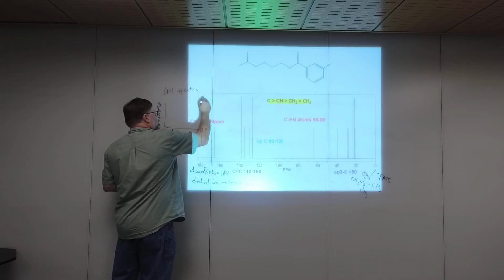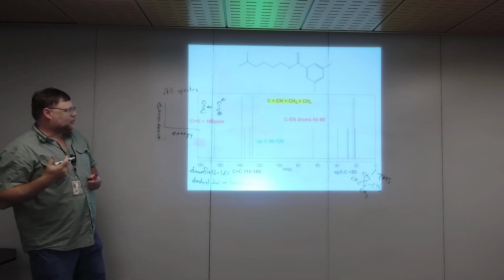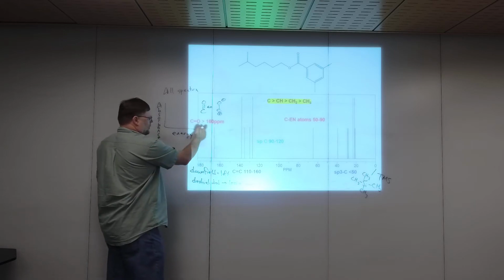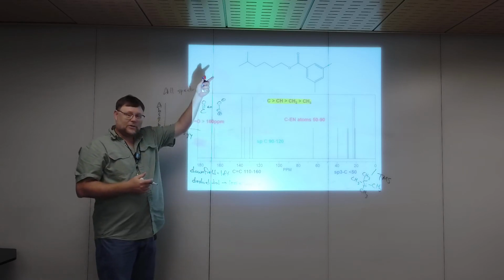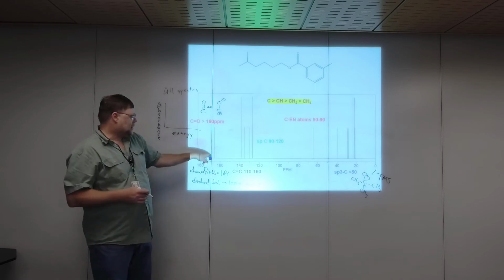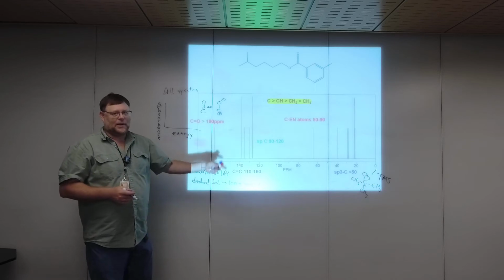And remember, there's this resonance structure. That oxygen's pulling electrons away from that carbon really strongly. So carbonyls of all sorts are going to come to the left. You want to use this in conjunction with the IR, which we just did. In the IR, there's this big peak right in the center of the infrared spectrum. If you see that peak, you've got to have at least one carbonyl peak in the C13 NMR, and vice versa. If I see a peak down here on the left, I've got to have a carbonyl in the IR, right?